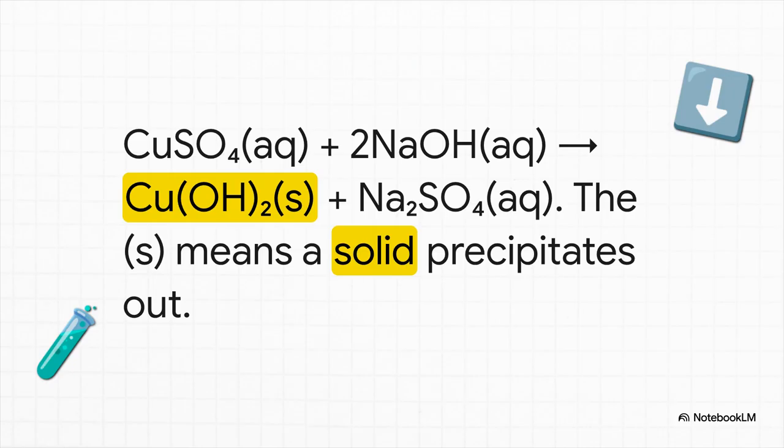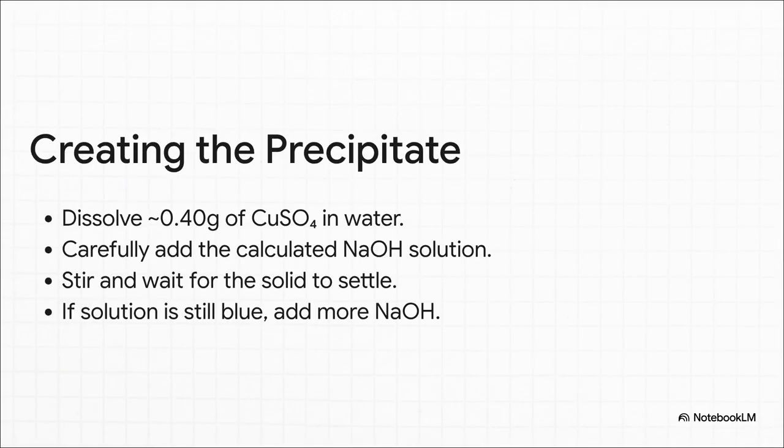But look what happens when they combine. We get copper hydroxide, and see that little s? That's the key. It tells us it's a solid. This whole process, where a solid just appears out of a liquid solution, has a name. It's called precipitation.